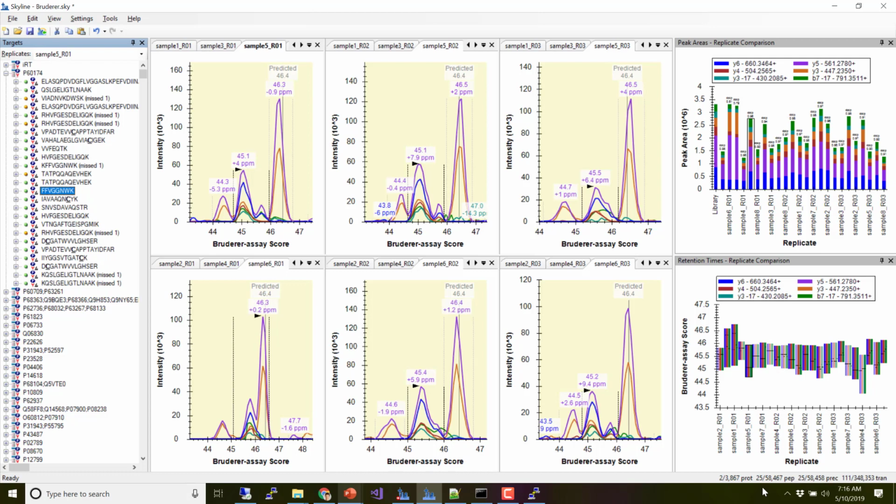Yeah, it's true. So what's the perspective to have a systematic cleanup of 50,000 peptides? Yeah, absolutely. Now, what's the perspective? Is it going to be a Skyline integration? For now, would we resort to an external tool? Yeah. So at this point, there are external tools under development. Do you have to say their names?